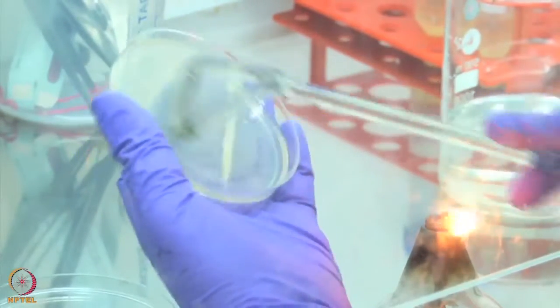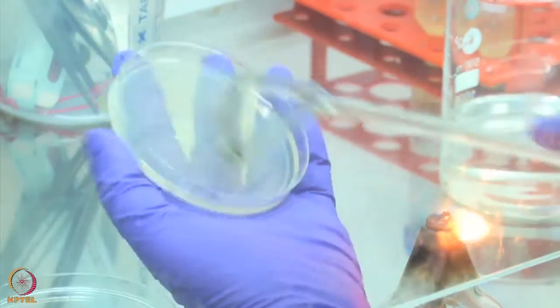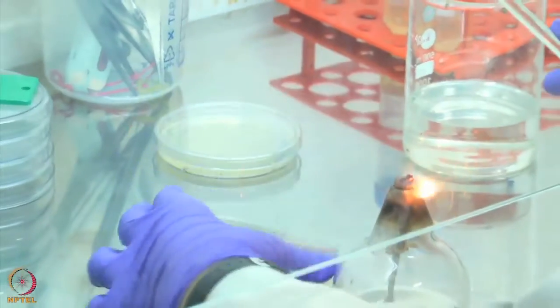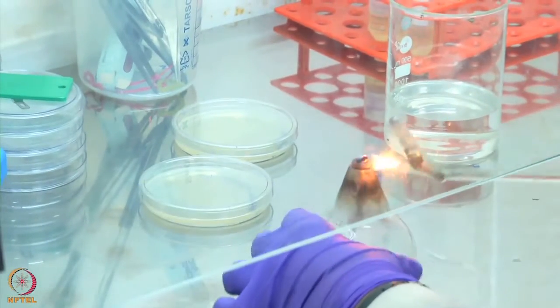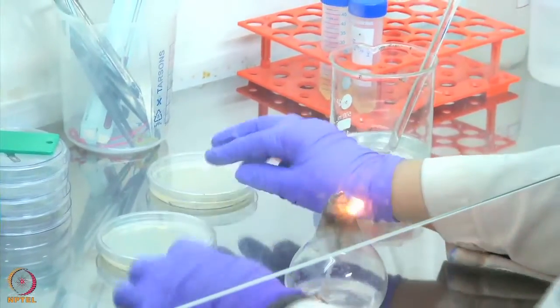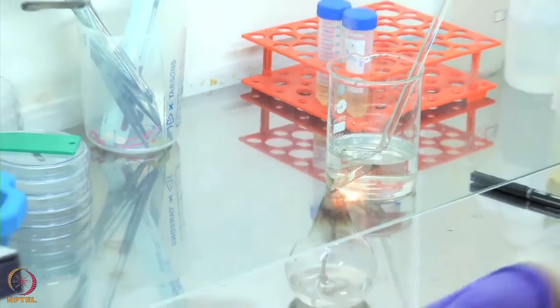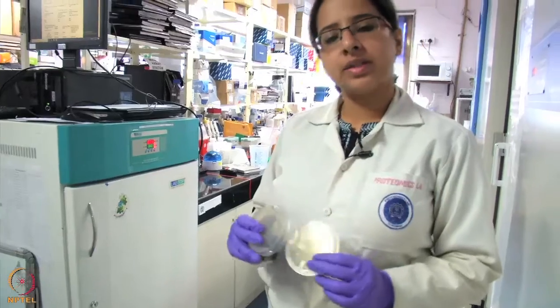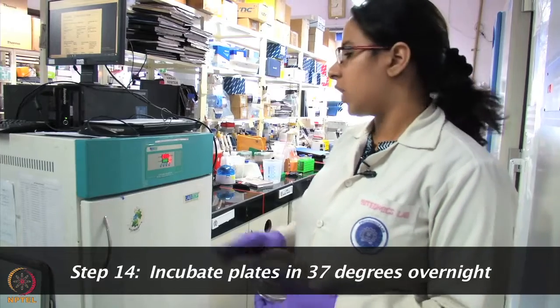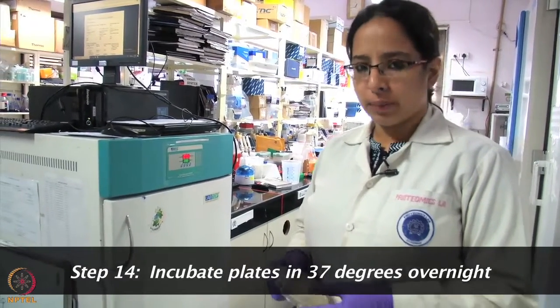Now I have started feeling some friction on the plate, so if I poke it further it may break. So at this point I'll stop. Now I'll take my plates and I'll keep them in the incubator. So these are the plates which I'll keep in the incubator for overnight incubation. As you can see, the temperature ranges from 37 to 38, which is ideal for the bacteria to grow.